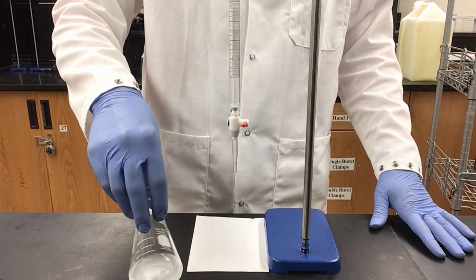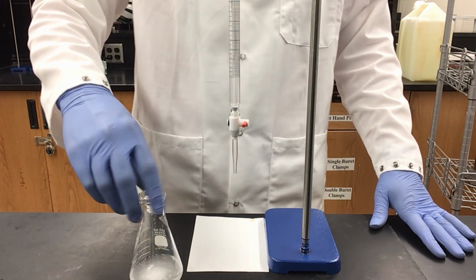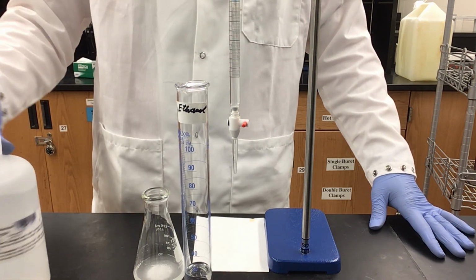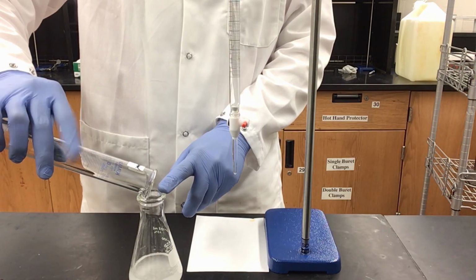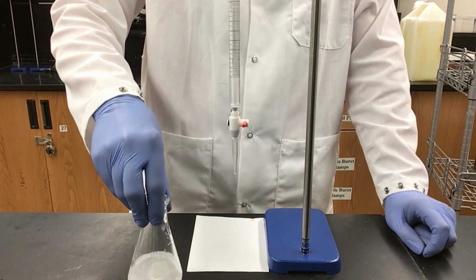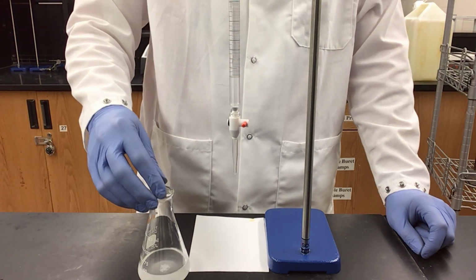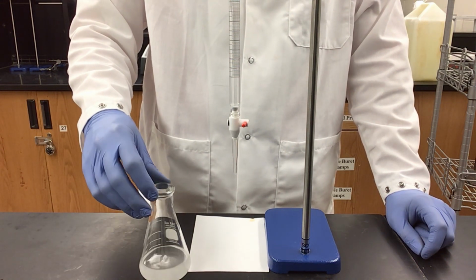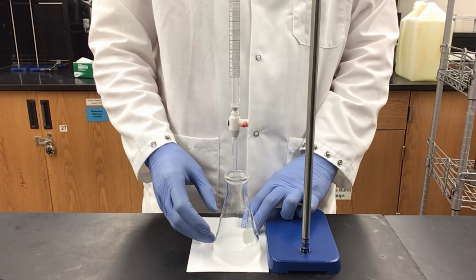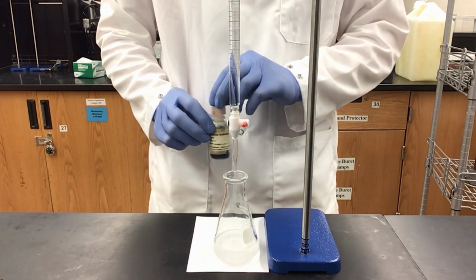But as you can see, it did not take too long for our tablet to dissolve and crumble into the water. Now that it has separated, I'm going to be adding 25 milliliters of 95% ethanol. We are adding ethanol in order to fully dissolve our tablet. The majority of our tablet has dissolved into our solution. Starch is used as a binder in these aspirin tablets, which the starch may or may not dissolve into our solution. So I'm going to take it as it is and add my thymol blue indicator.